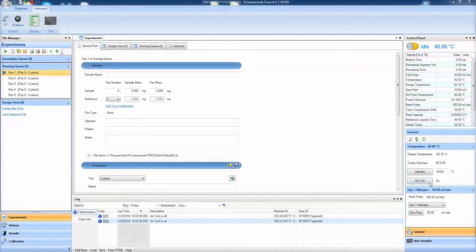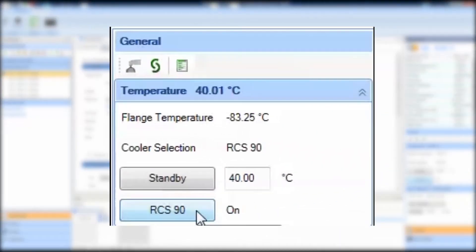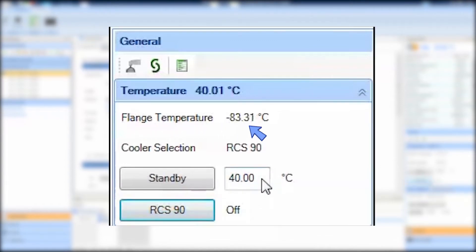In Trios, click this button to turn off your RCS. Wait for the DSC cell-flange temperature to get above room temperature. This takes about 10 minutes.